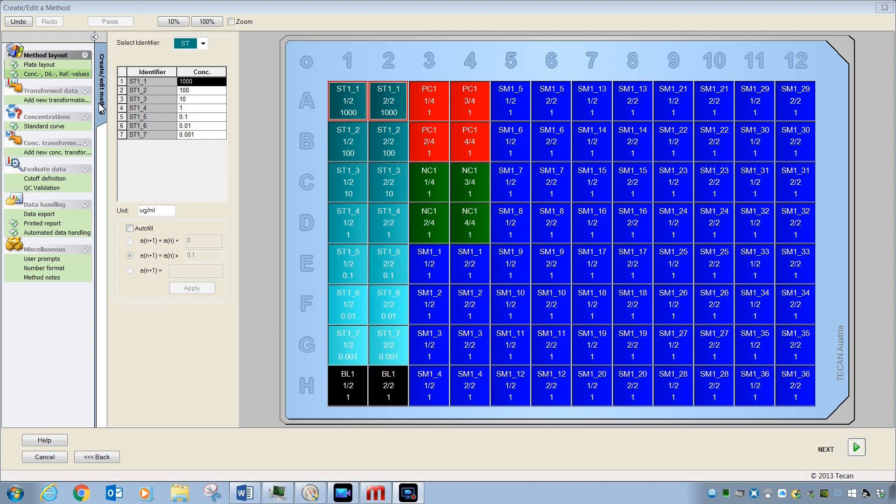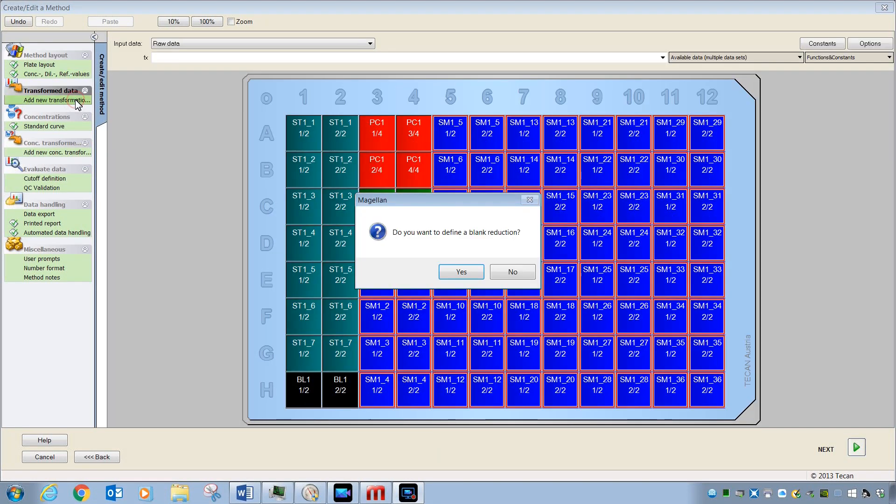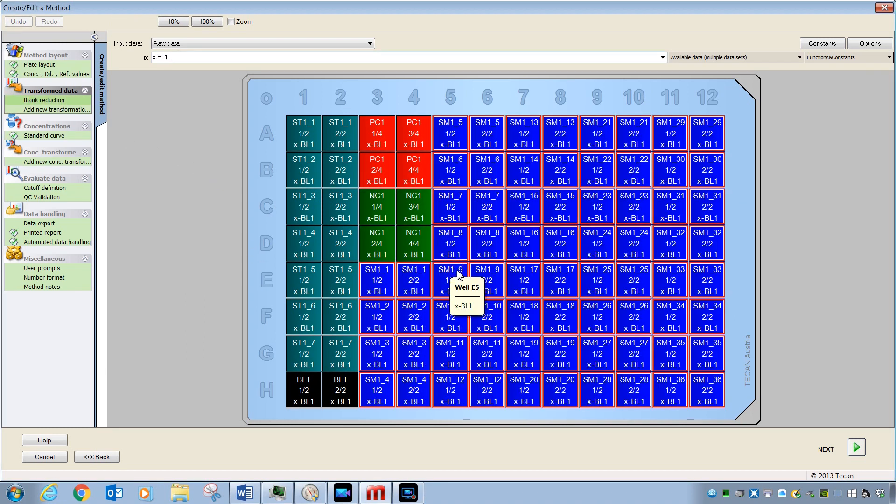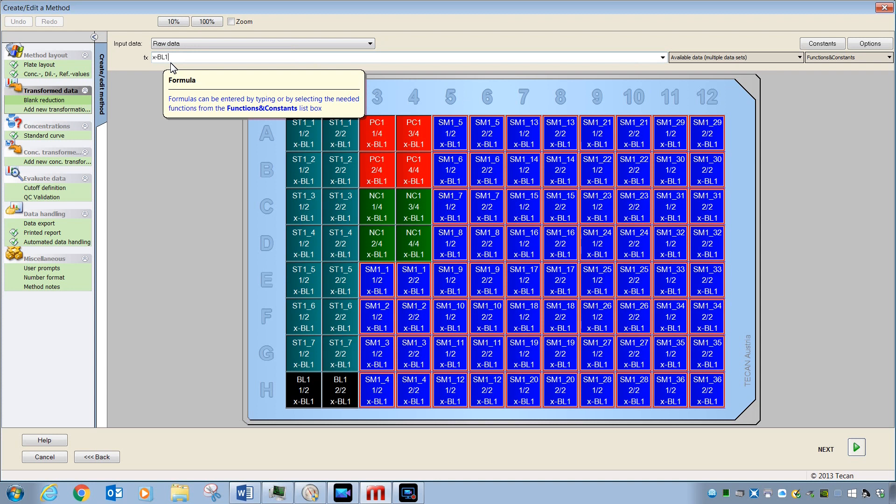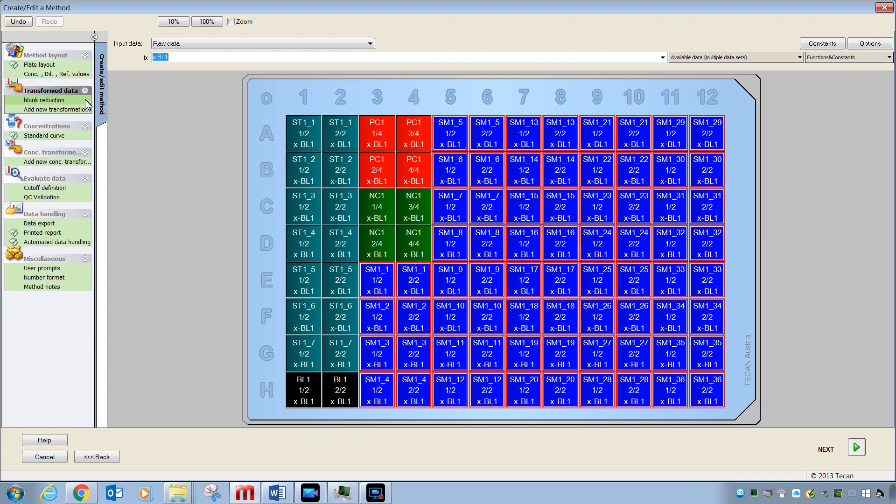Once you have your dilutions entered, you will want to strike the Add New Transformation button. Here, Magellan automatically sees that there's a blank on the plate and if you pick Yes, it will write a calculation that will subtract the average of these two blanks from the rest of the wells. With this blank reduction calculation in place, it is using input data as raw. It's called X minus BL1 and the name of that transformation is called blank reduction. Magellan will automatically create this blank reduction transformation if you have a single measurement set for your plate reader and this is your first time passing down through the process of creating a method.